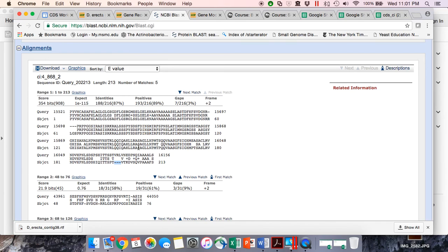Actually, up here it's 4 amino acids: 1, 2, 3, and then 4. You're probably thinking, well, which was it? An insertion or a deletion? We can't tell. But what we might want to do later, after we annotate the entire gene, is compare the amino acid sequence of different species of Drosophila.